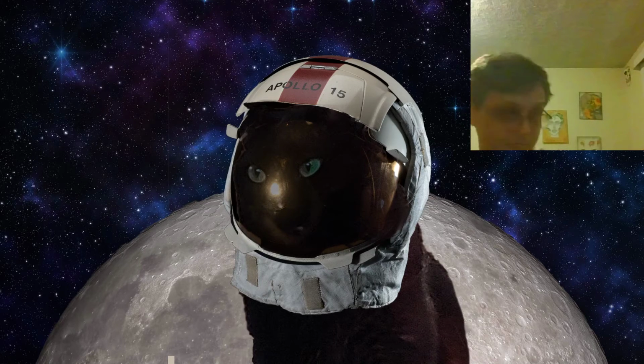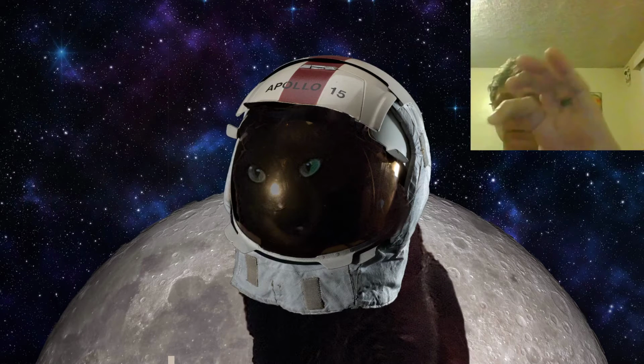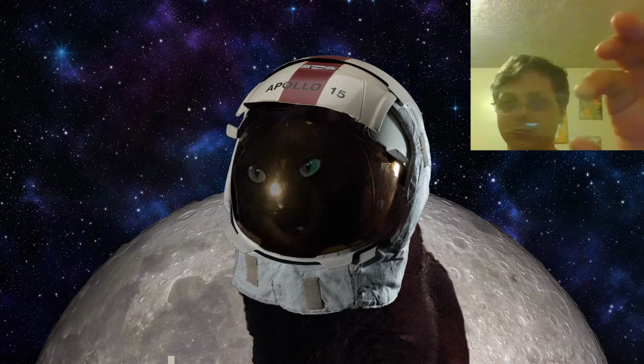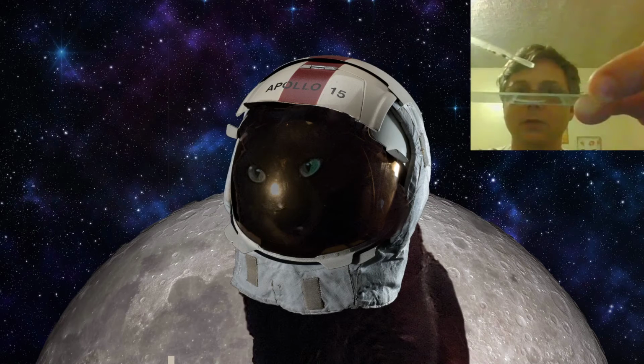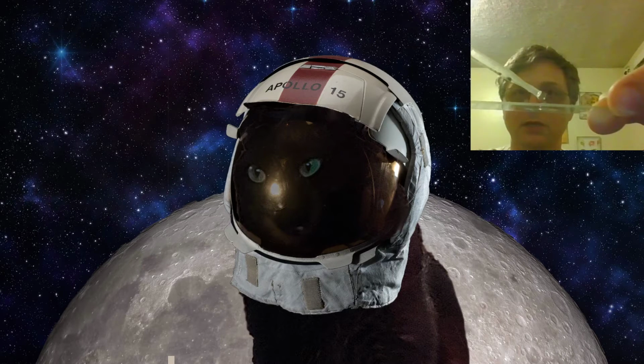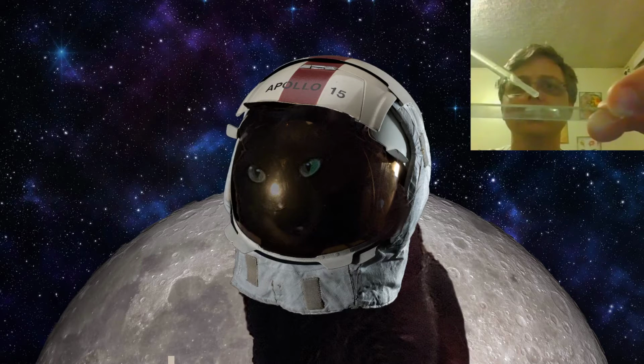So, there we go. Depression slide. You see the little bulge in there. I'm just going to put some water right on there, and some junk.